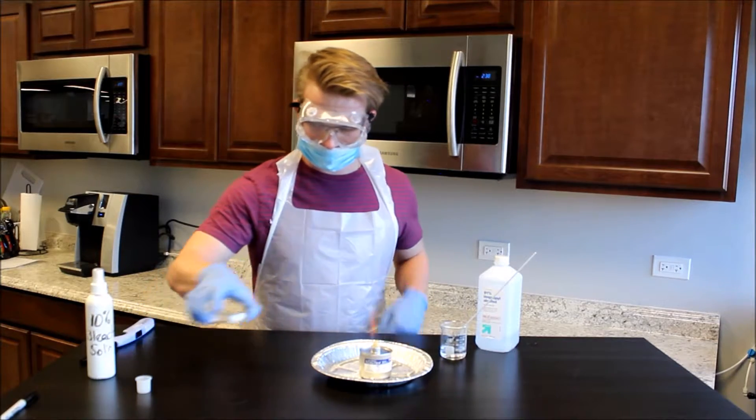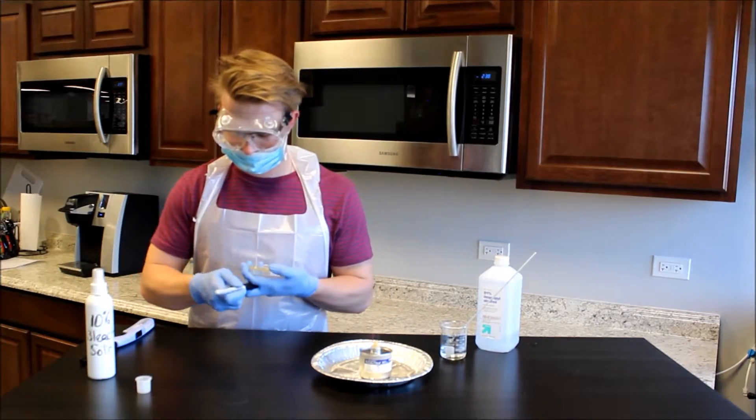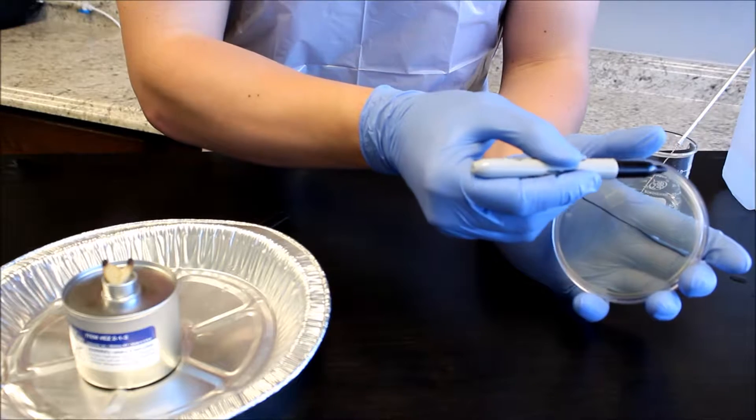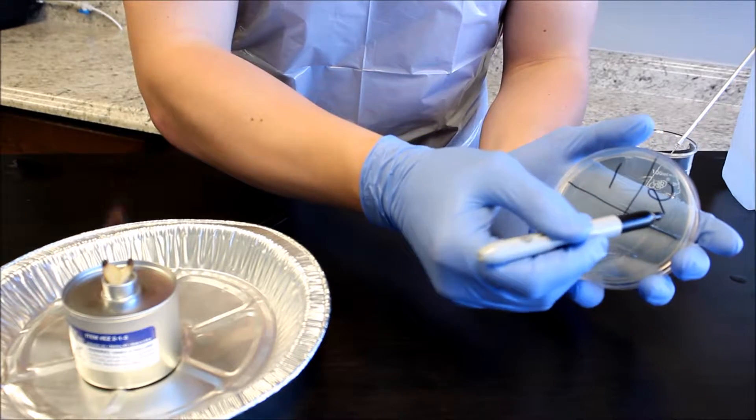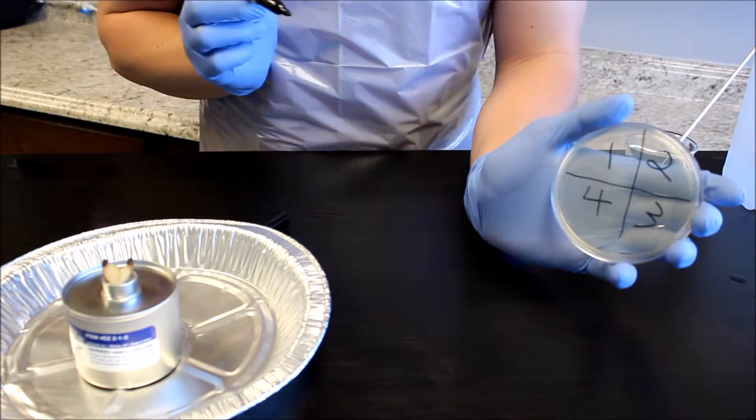Place a 90 mm TSA plate on the work space. Without opening the plate, use a permanent marker to divide the bottom agar side into 4 equal sections to illustrate quadrants for streaking. Label the quadrants 1, 2, 3, and 4.